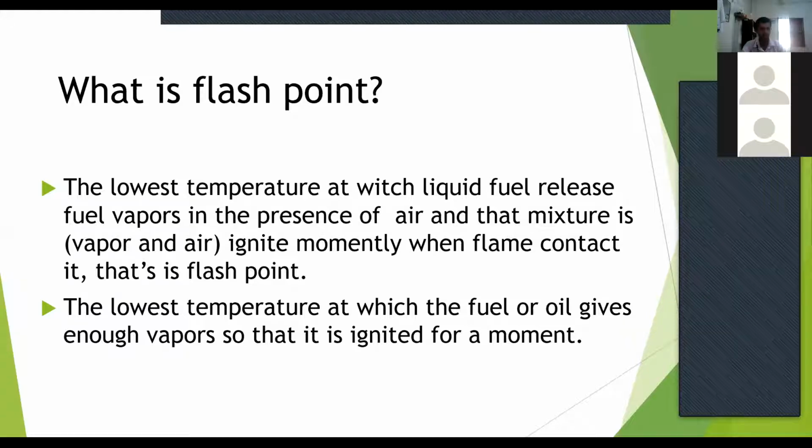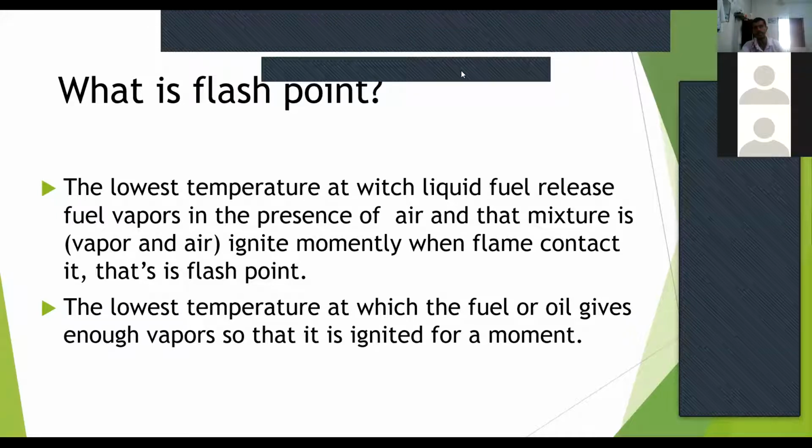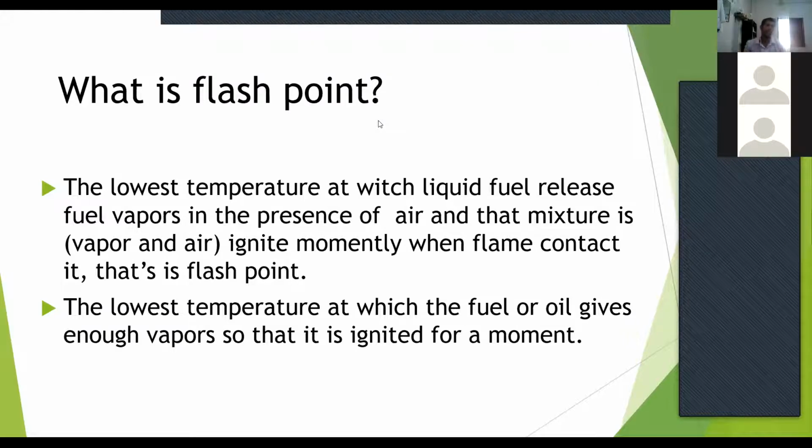That we call the flash point of that particular fuel, and it will vary according to the fuel. By introducing a flame into the atmosphere of the sample, we can find that there will be an ignition with a pop sound.